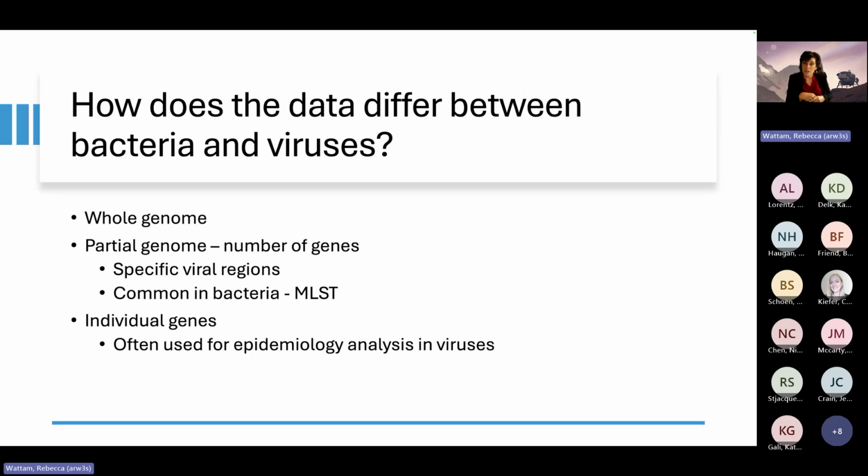For bacteria, generally because of size, you use less than a whole genome and you're looking at the number of shared genes. Although you can do a whole genome sequence and look for specific SNPs when you have a bunch of bacteria that are very, very closely related, like when they're undergoing an outbreak, let's say, and you're looking to monitor changes, because there'll be very few changes and the data won't be so big. But, in general, you scale down on that.